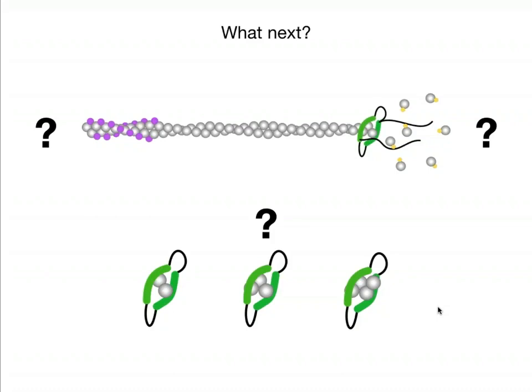The most straightforward experiments would, of course, be to just look at the actin elongation in the presence of an elongation factor, such as formin here, or in the presence of a depolymerization factor, such as cofilin. Another interesting question will also be to ask, what is the nucleus size in the presence of a nucleating factor, which again, formin also nucleates actin filaments. And we're in the process of also asking and answering these questions.